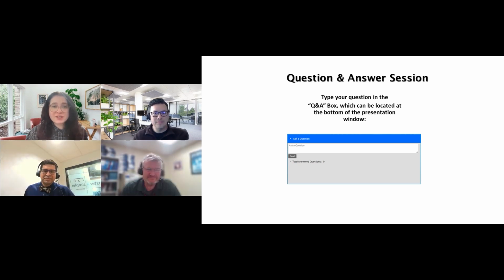All right, so the first question I have here, Chris, I think might be a really good fit for you to answer, which says, how is the pyridine peak shape on the RMX column and at what concentration is it? So it's a really good question because first, in order to optimize pyridine peak shape at the front of a chromatogram, you have to make sure that you have an efficient sample transfer to the head of the column. And the way we've done that is we optimize the peak shape for 1,4-dioxane, which means that we have an efficient transfer and we don't have any interference from the methylene chloride.